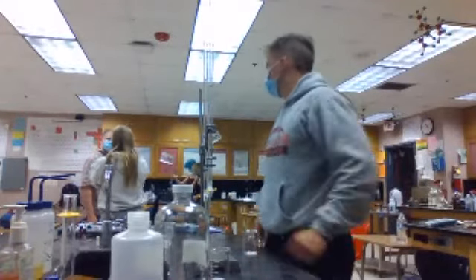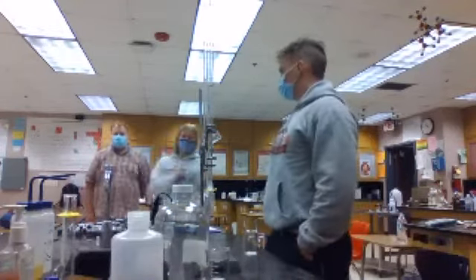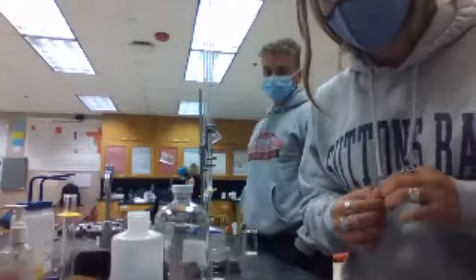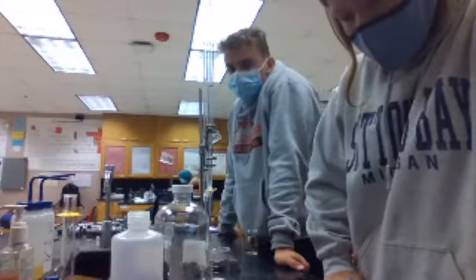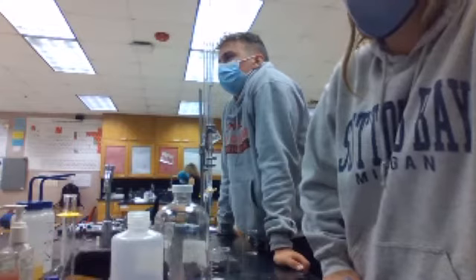Last time you gave us 7.32. Yes. Did I put that in the right place? It's supposed to be 19. So yeah, you won't know the end until the end. Okay. Now, here's the deal. For this trial, whenever you reach 7, are you doing the pH one, right? Yeah. So whenever you reach 7, that's when you end the NaOH here. But then you keep adding until you get that high end of the graph.